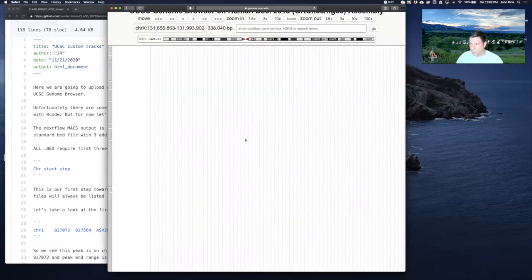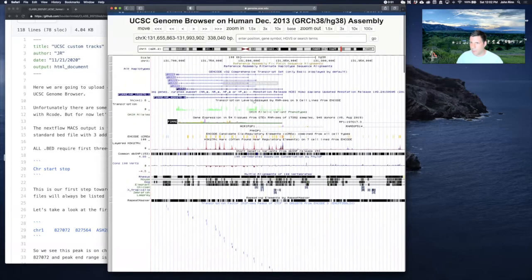And if we zoom out even more to see the end of the gene, we'll probably start to see more RNA-seq, and zoom out even more. And we can see more RNA-seq throughout here. And then we can look at where it's more expressed. And now we can see many more transcription factor binding sites since we zoomed out.